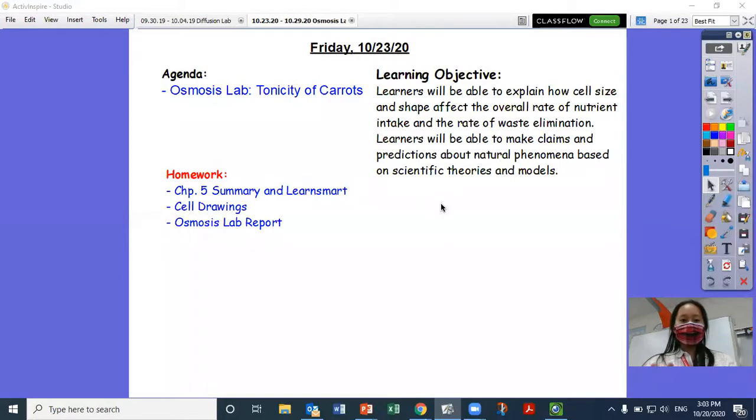All right, so in this video, I'm going to walk you through the setup for the osmosis lab, where we're going to be finding out the tonicity of carrots, and you're going to be able to predict the calculations and relative concentrations of the solutions that we're working with. They're all going to be a mystery, and they're going to be color-coded from the start.